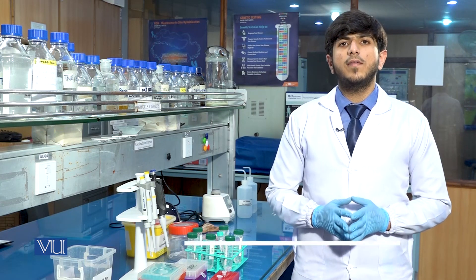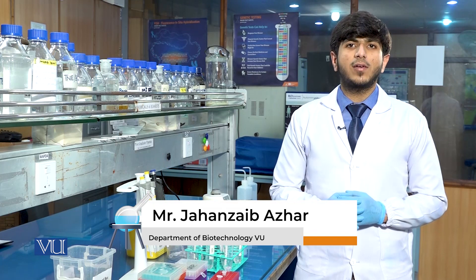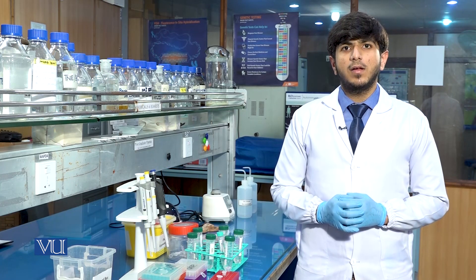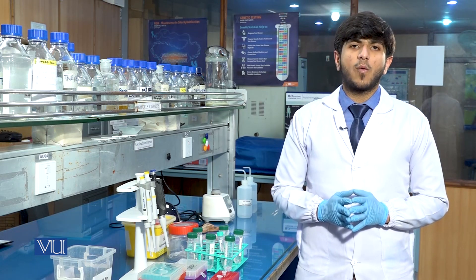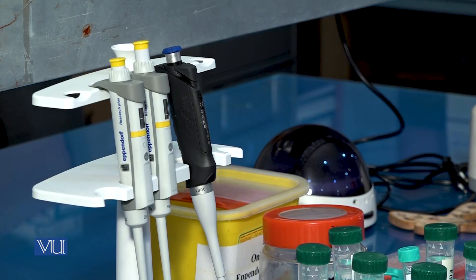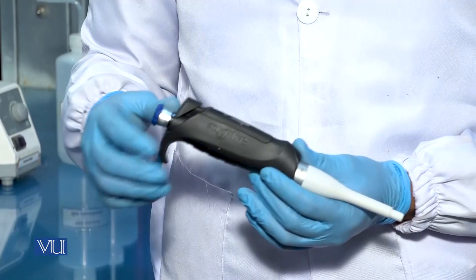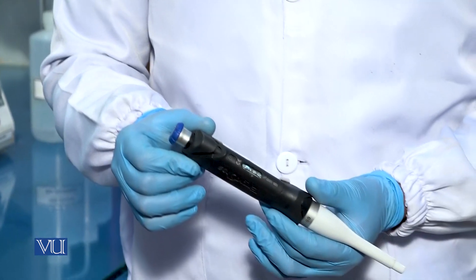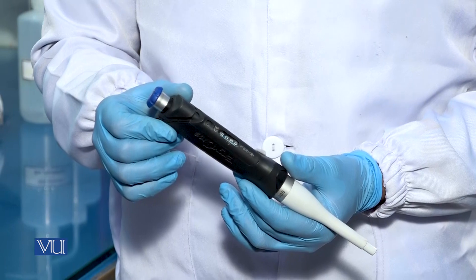After the addition of 80 microlitres of SDS, we will add 250 microlitres of buffer A1, which will be used to stabilize the DNA at the required pH. We will take a pipette of range 100 to 1000 microlitres and set it to 250 microlitres in order to add buffer A1 to the solution.